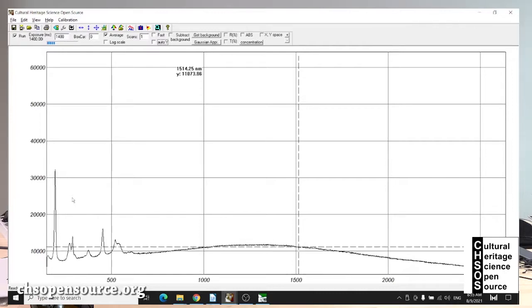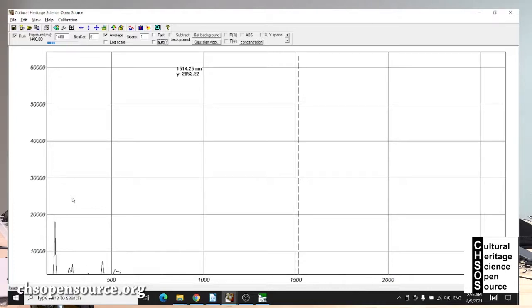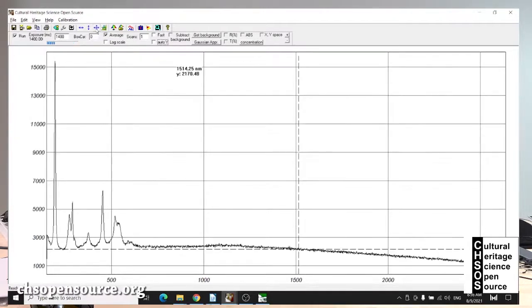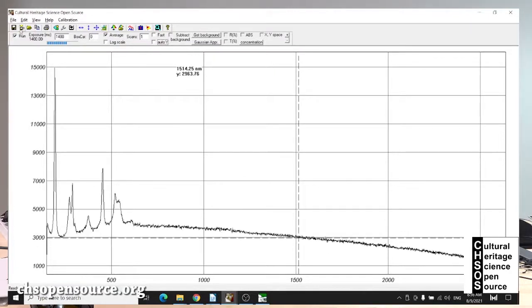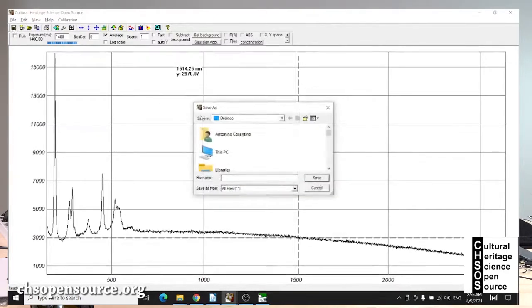Okay, so right now basically you see what happens is that I close the knob and we see a better defined peak but smaller. So what I can do is I change the scale, so now we see it better, and we save it as it is. Okay, so we go here, save. So this will be lead tin close slit.